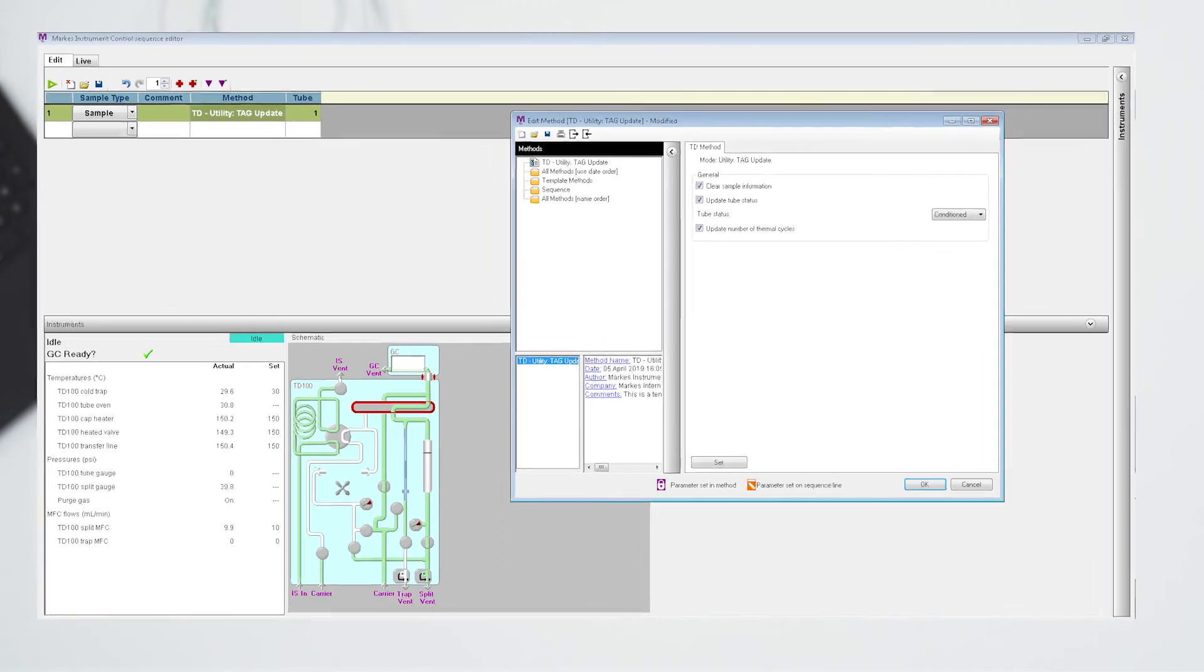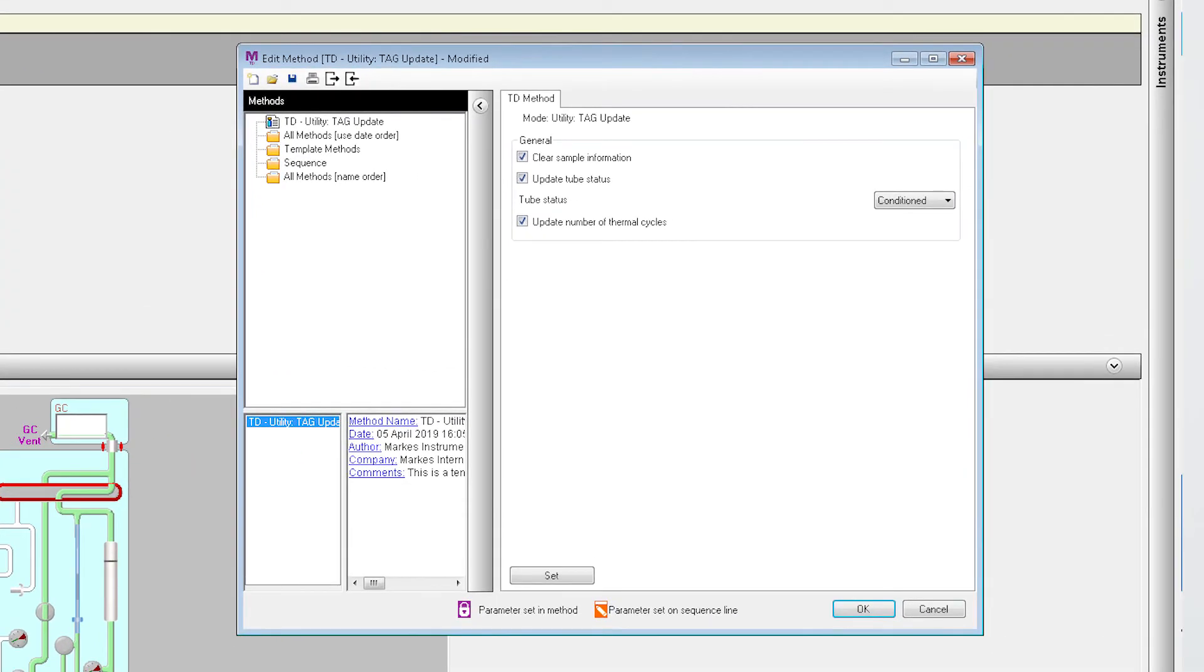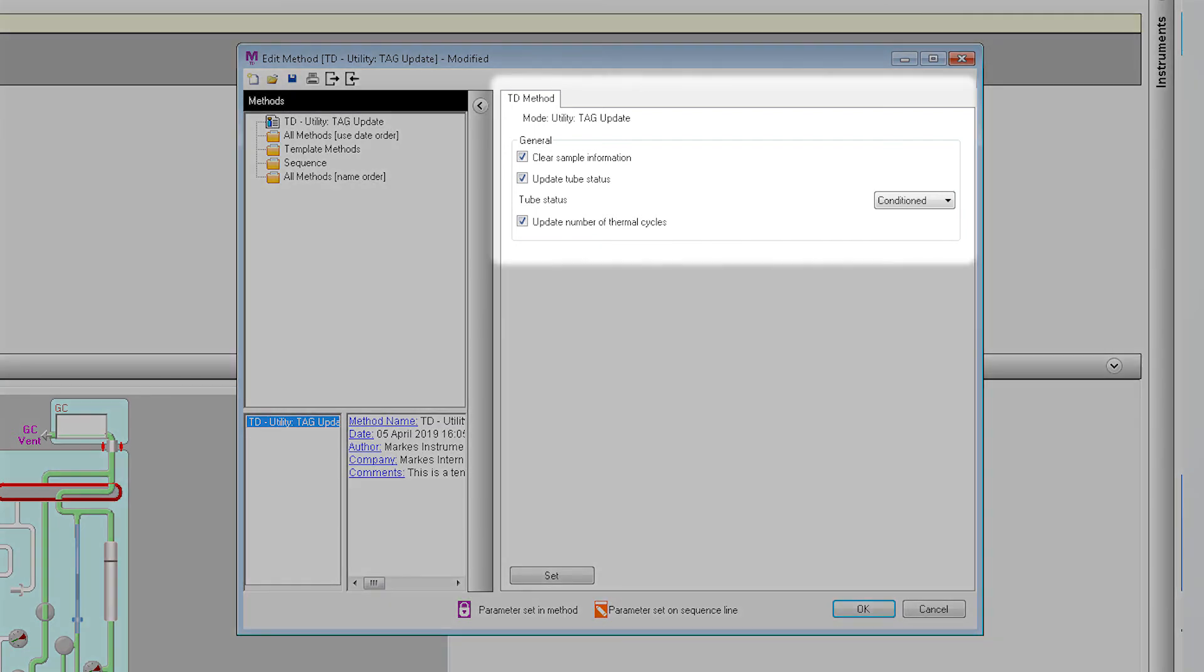To batch update, load all tubes and run the TD utility TagUpdate method. You can use this method to batch update tube status, number of thermal cycles or clear sampling information from the tags.